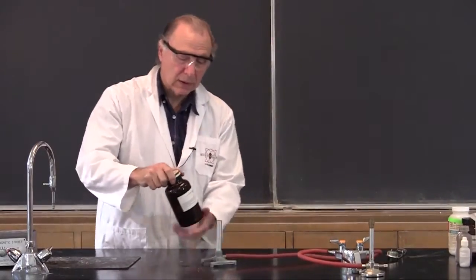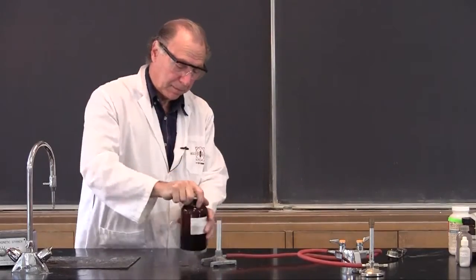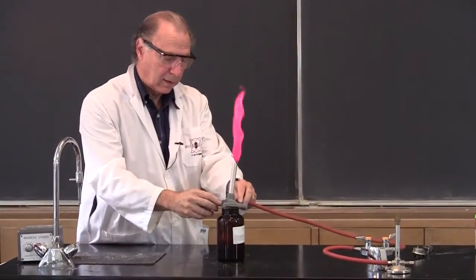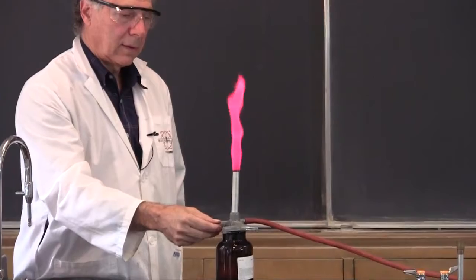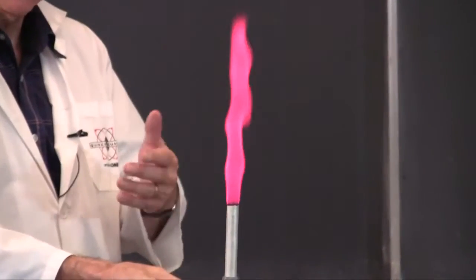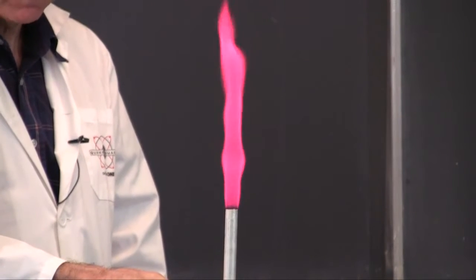It's always a nice deep crimson red. So this is lithium carbonate. Now this crimson red looks very spectacular in real life. Not sure how good it comes across on the camera.